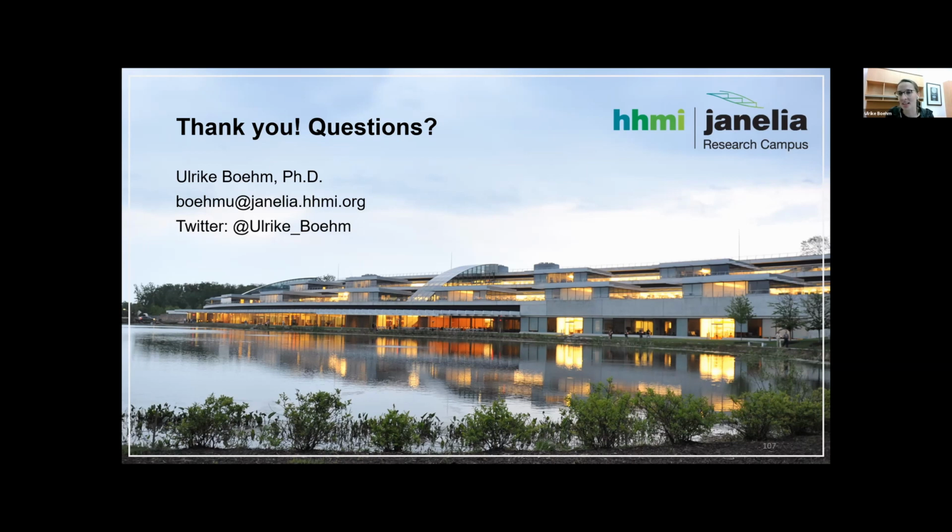You might then, in principle, when you spread it out, need to accumulate the signal over a longer time, meaning you might need a longer exposure, or you might even need better dyes with more fluorophores, or with a higher photon budget. But about the 3D or third dimension, there are different ways to do this. I think the group of W.E. Moerner at Stanford came up with the double helix, which is quite extended, even more than just a micron. I think it even goes almost to 2.5 microns.